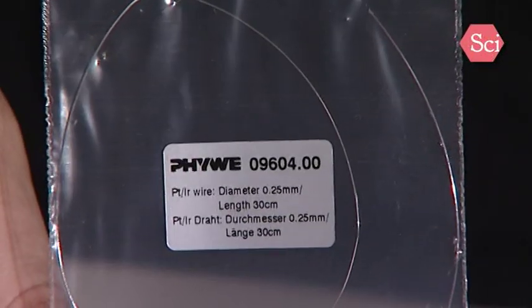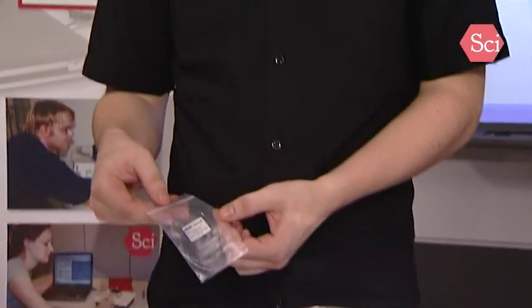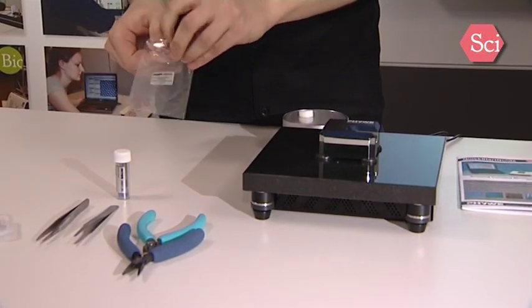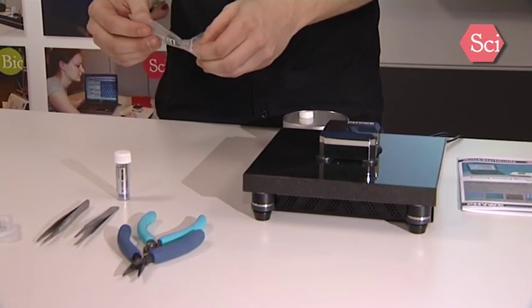This is the platinum iridium wire which we will use to cut a measurement tip. On delivery a measurement tip is already installed in the system. Nevertheless, I will show you how to prepare a fresh tip using the platinum iridium wire and the tools supplied in the toolbox.